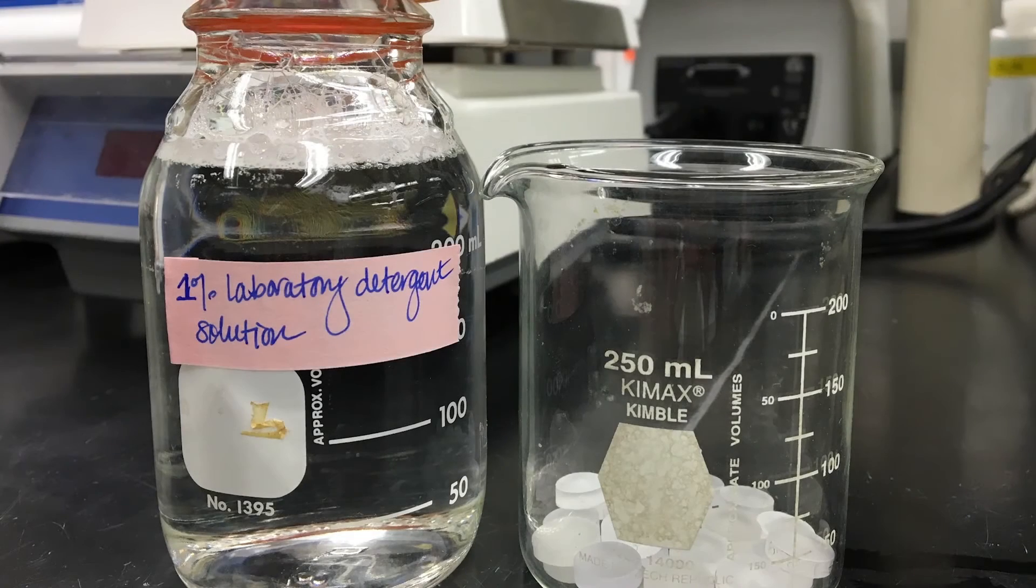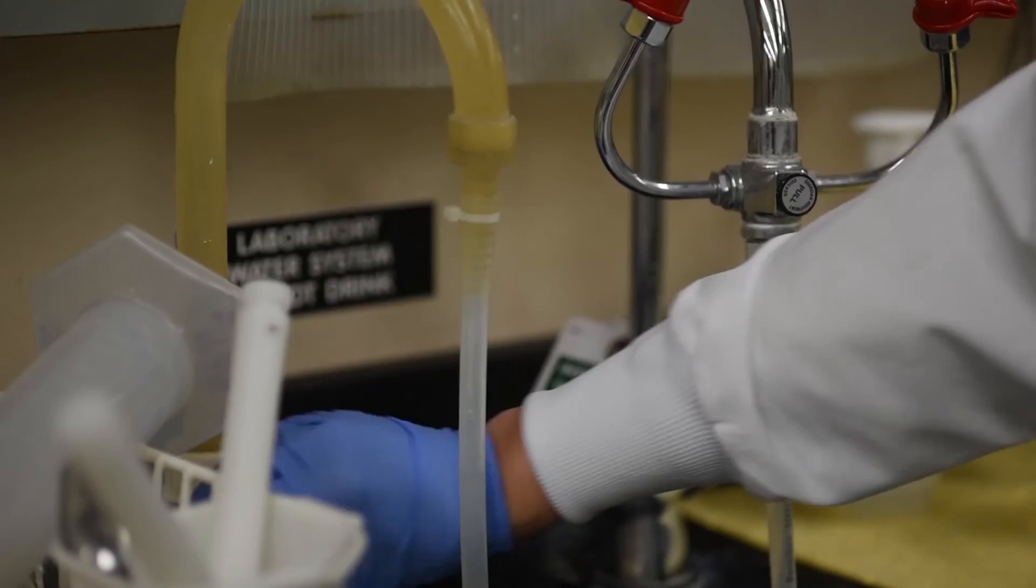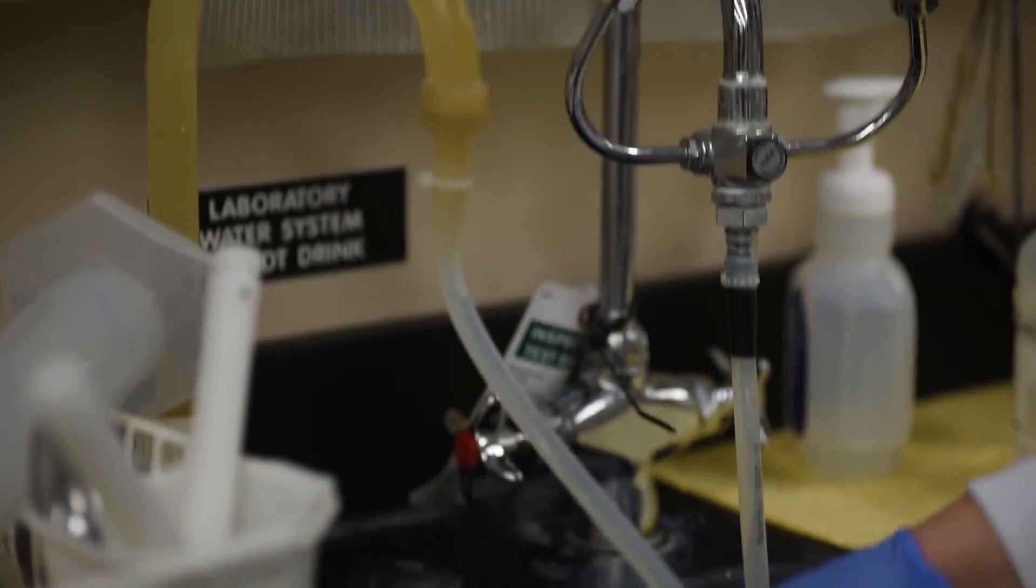For other coupon materials, polycarbonate for example, place all coupons in a beaker with 1% laboratory detergent solution. Sonicate, rinse and dry as described earlier.